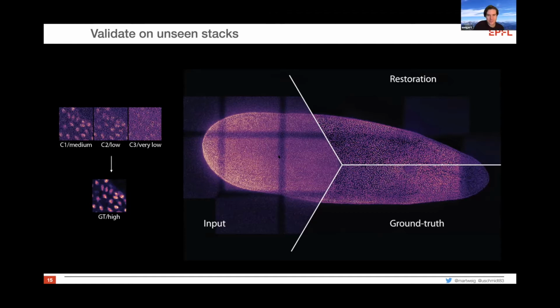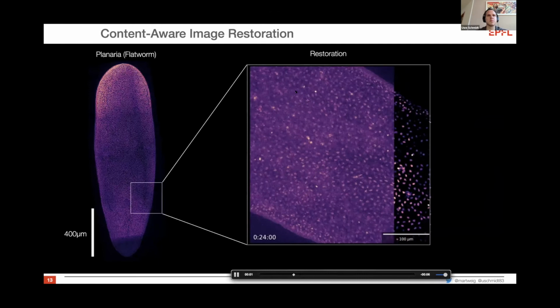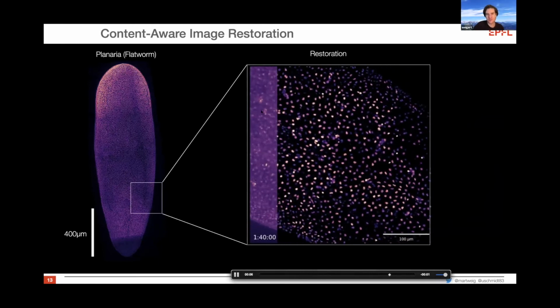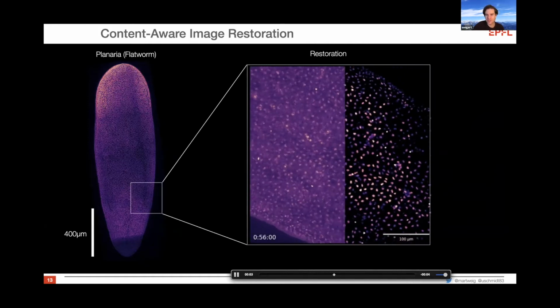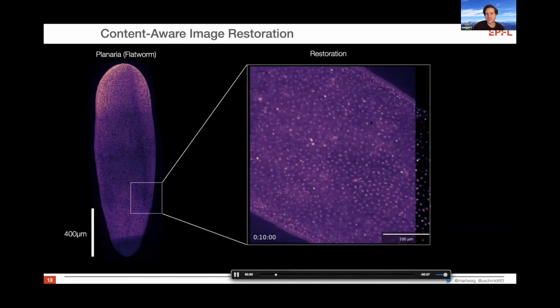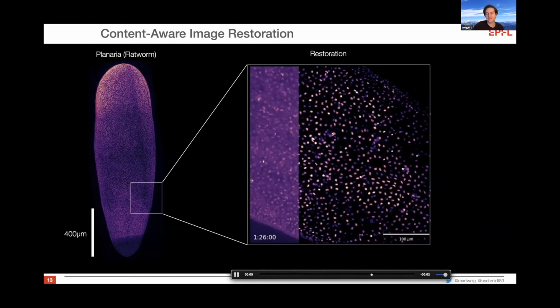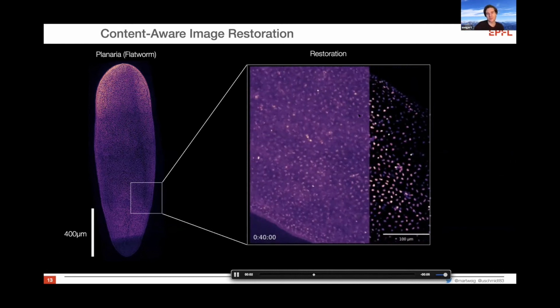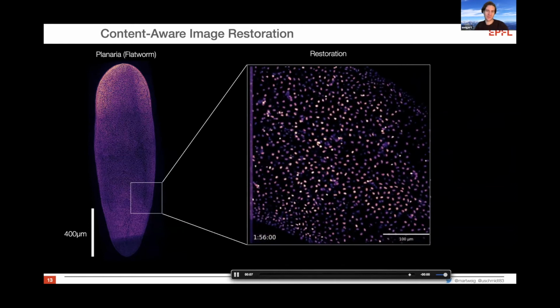Gotcha. So this is essentially what Mark was saying. If you look at this, annotating those nuclei is super hard. If you want to segment those cells, just annotation of the low SNR is super hard. If you denoise it before and then just do a simple thresholding, it would already get you a lot of those masks for free, which you then can curate way easier than it would be possible in the original one. And in this way, you can generate quite easily the annotation mask for a segmentation step. That is what you're actually after at the end, right? So that's what Uwe just described.